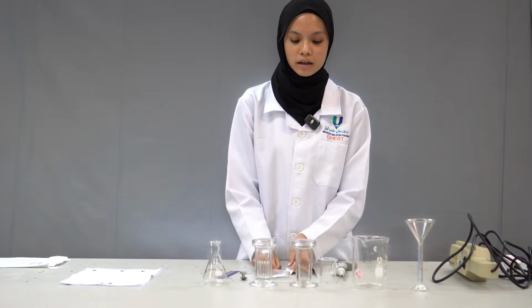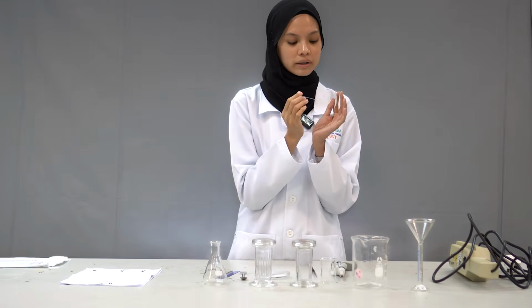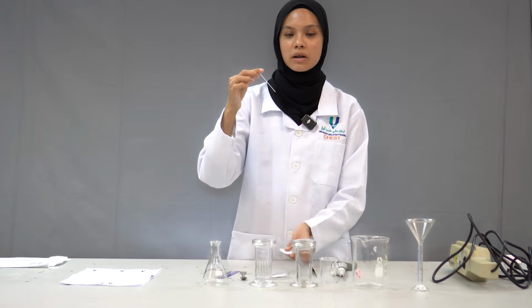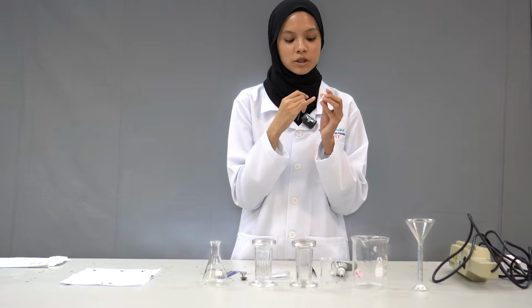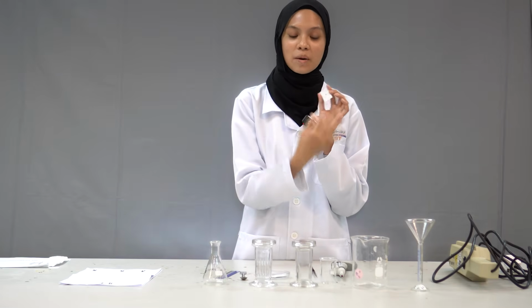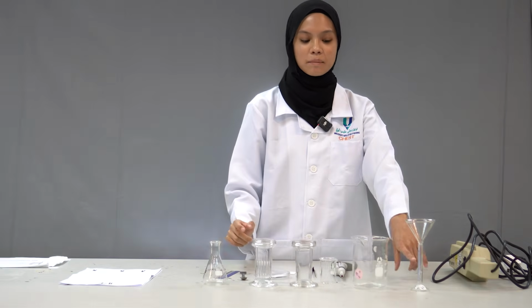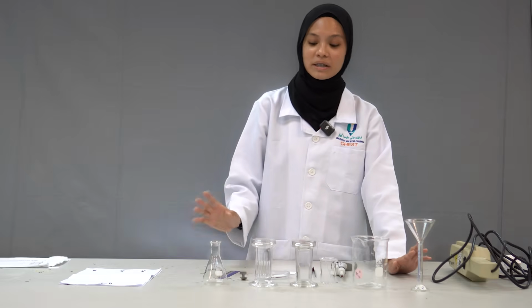And then we have the capillary tube to spot the compound solution on the plate. It is better to use a capillary tube because it prevents the spot from overlapping with the other solution next to it. We also have measuring cylinders to measure the solvent.